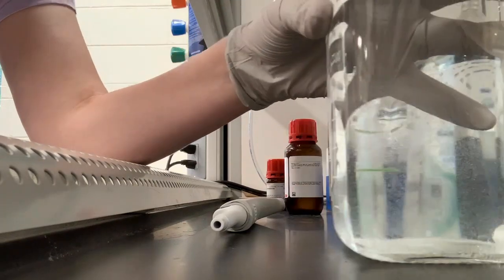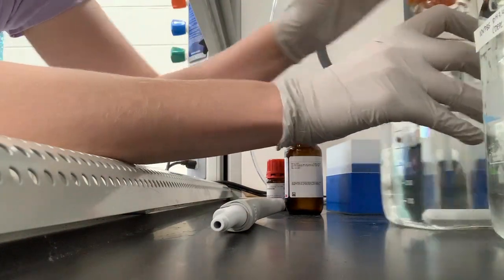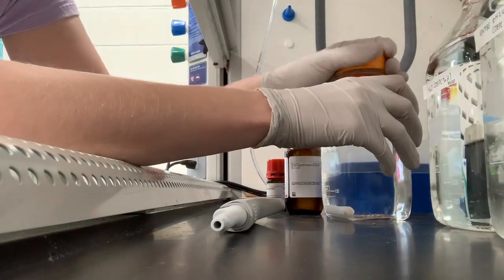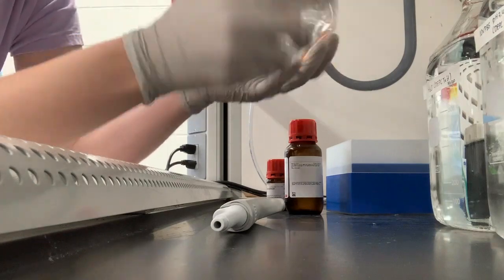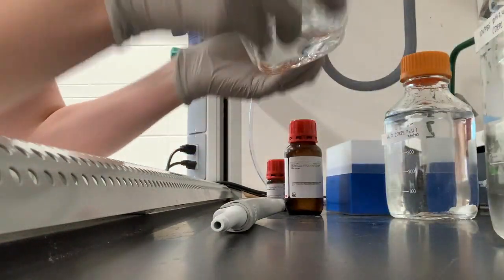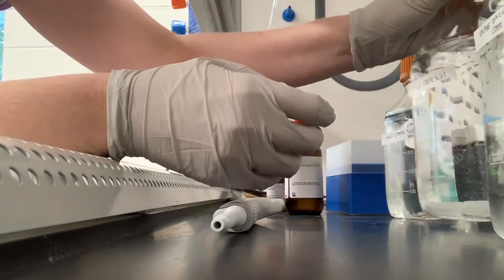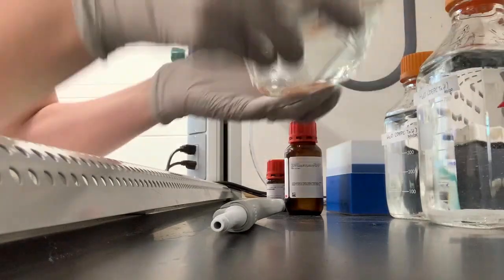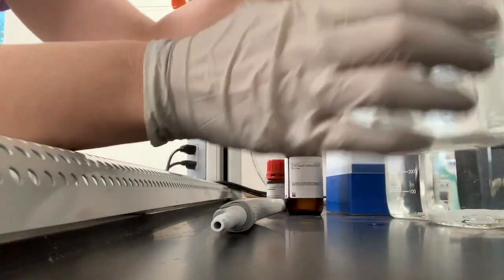And so what you want to do is cap these bottles tightly and then mix the Dep C with the water or with the solution. The reason you want to do this is so that the Dep C coats all the surfaces of the bottle. You don't want any RNases anywhere in the bottle, and so if you don't do this mixing step, there could be some that still survive the process.